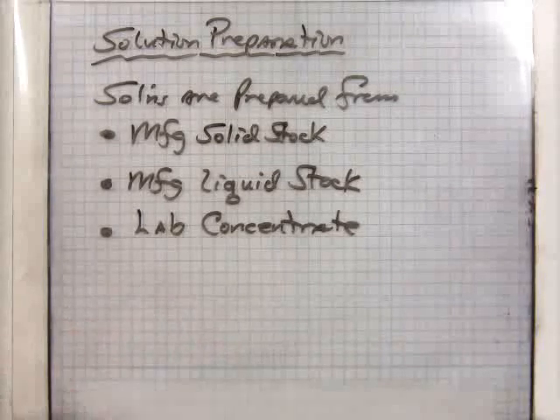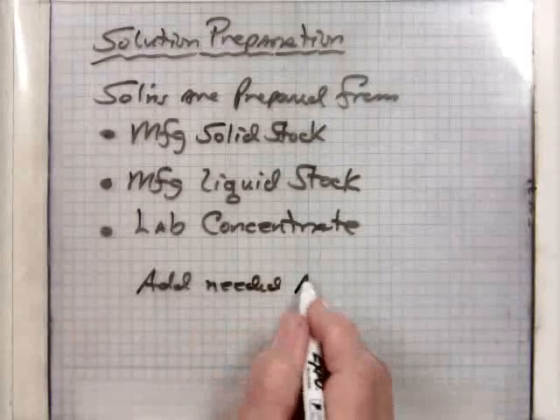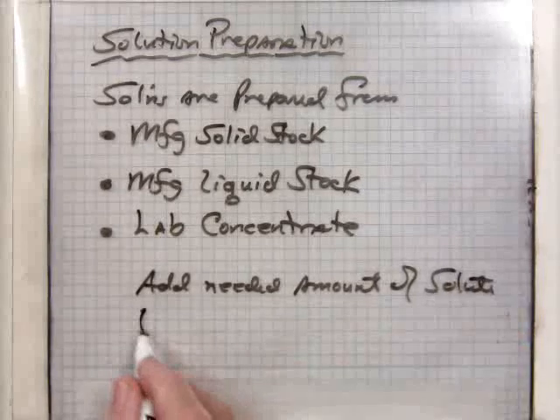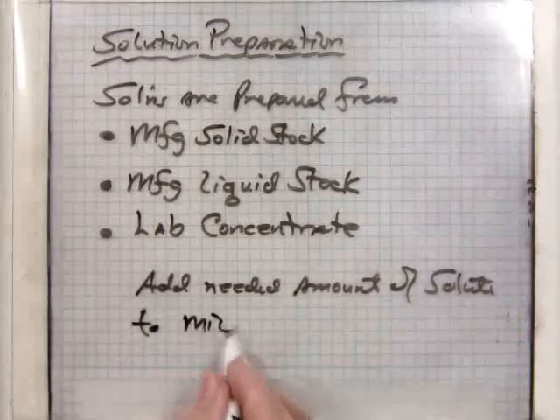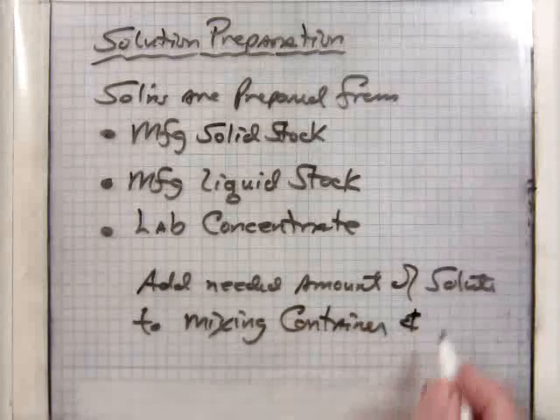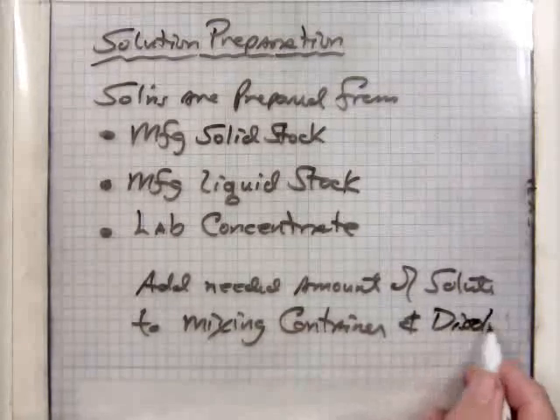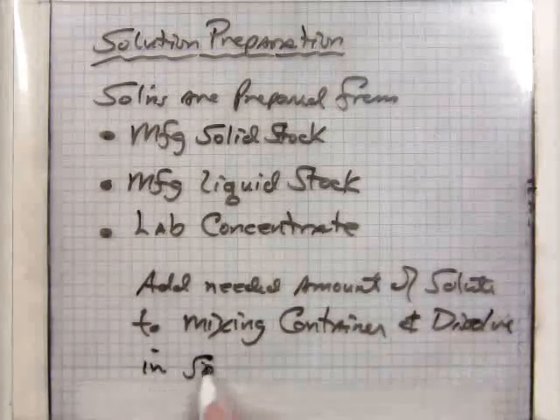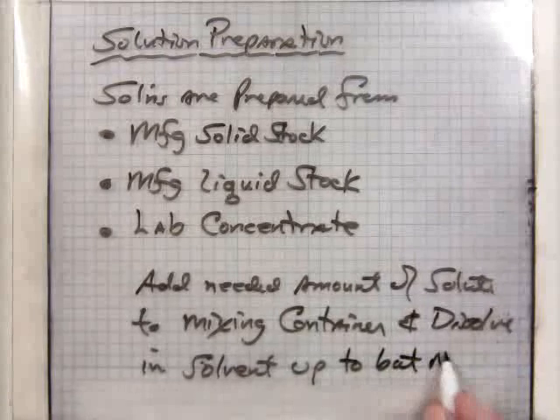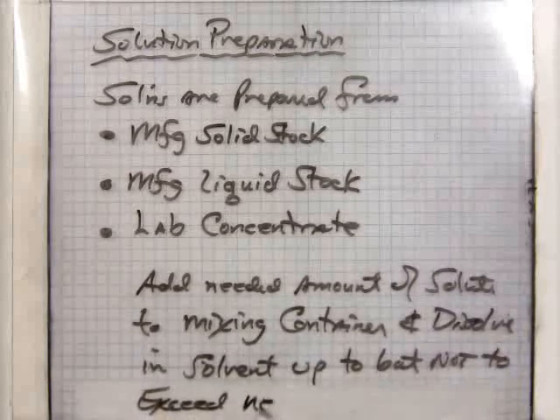So in verbal context, add needed amount of solute to mixing container and dissolve in solvent up to but not to exceed needed total volume.